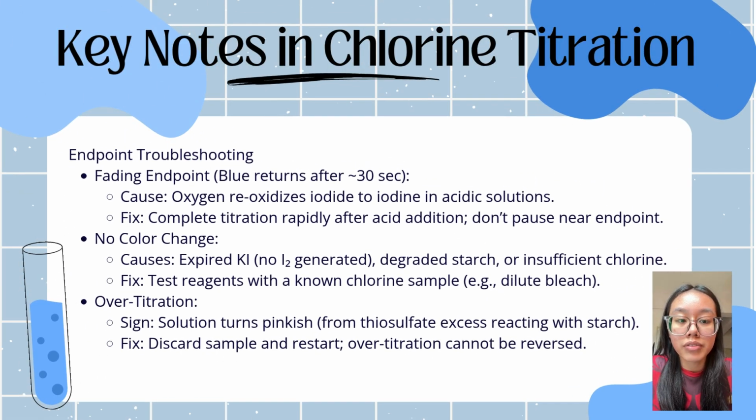Endpoint troubleshooting. First, a fading endpoint, where the blue returns after 30 seconds. Cause: oxygen reoxidizes iodide to iodine in acidic solutions. Fix: complete the titration rapidly after acid addition and do not pause near the endpoint.